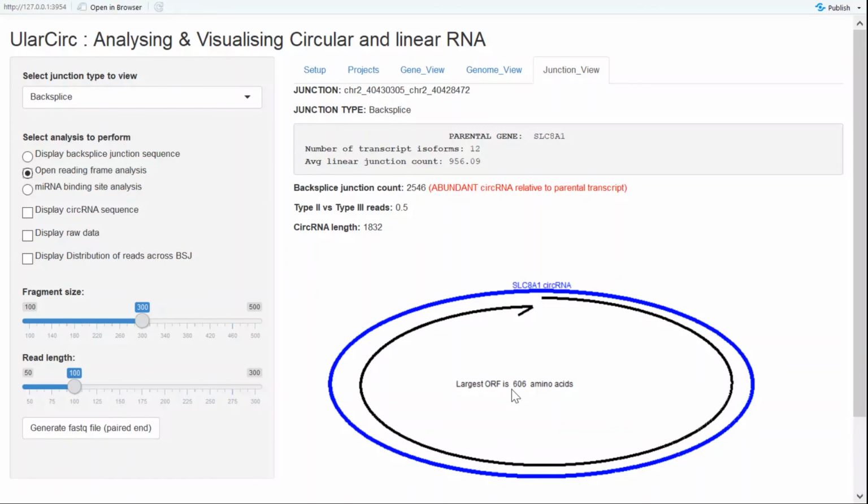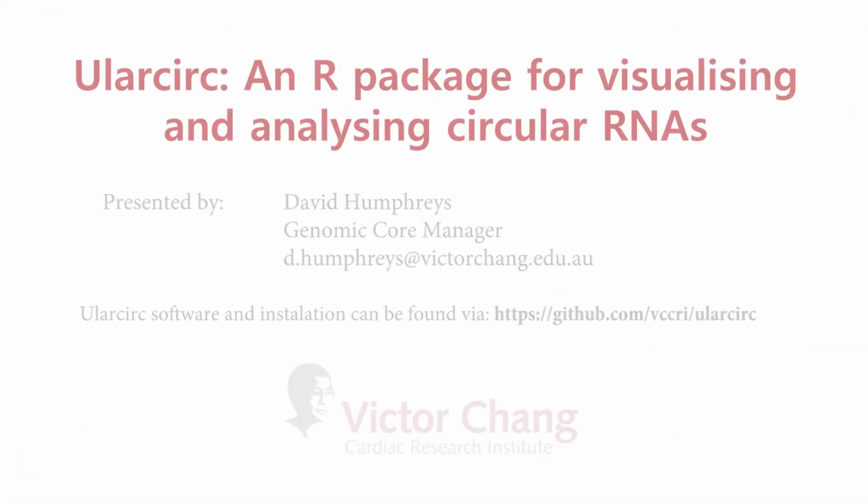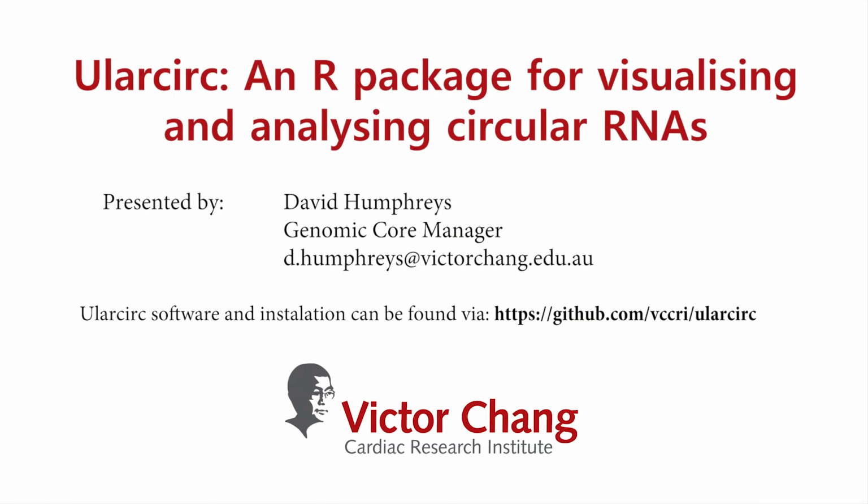So there you go. There's a quick analysis for you of circRNAs from a heart dataset. Ularcirc has other features which I'll address in other screencasts down the track. Hope you've enjoyed viewing, and hope you enjoy using the software.